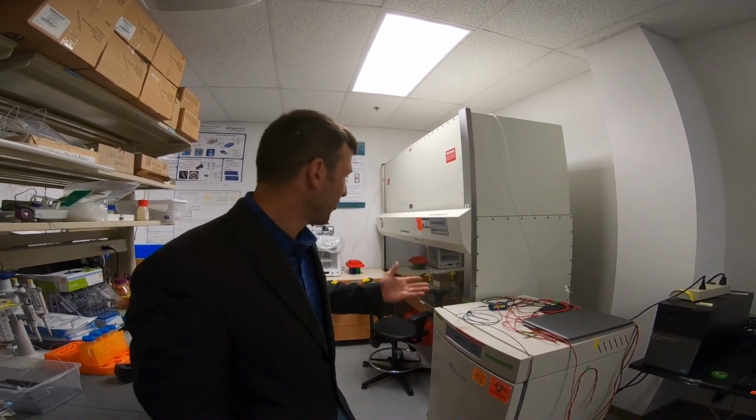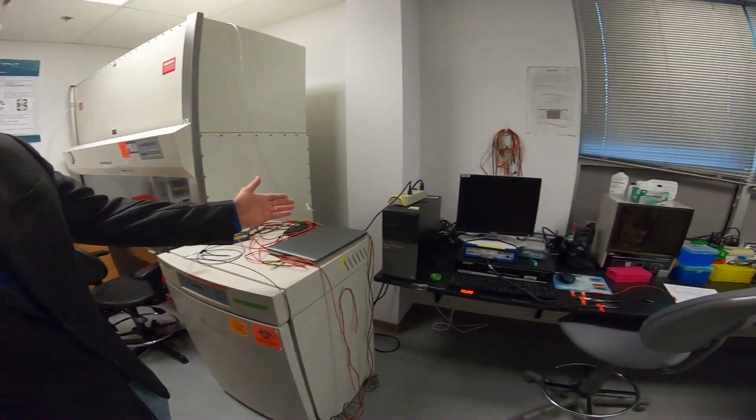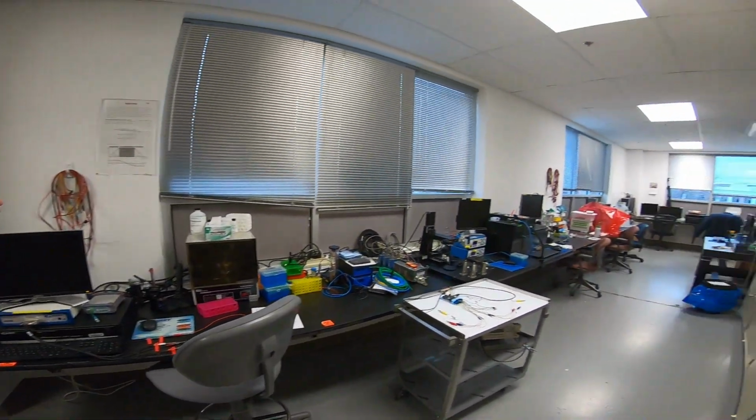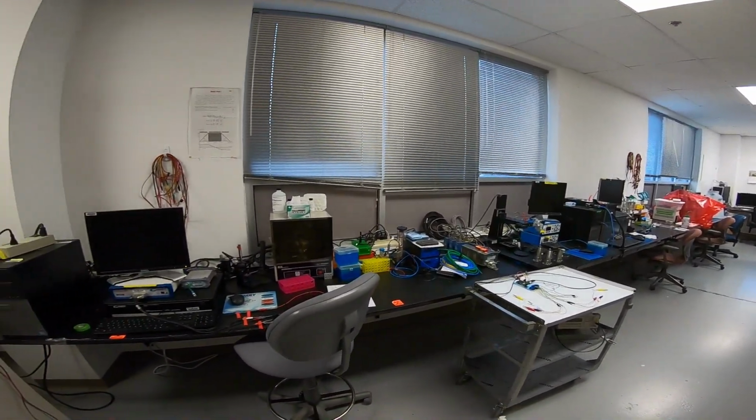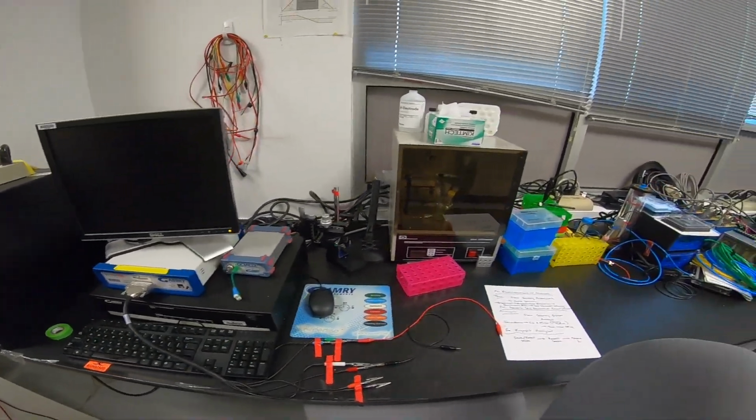So in the biomanufacturing and biosensing lab, we're very lucky to have access to some really top-of-the-line analytical capabilities and resources for both biomanufacturing, for growing microbes and developing processes that are based on microbes, and characterizing those products and those processes. In the corner of the lab, you can see here that we have dedicated biosafety cabinets and incubators for cell culture applications. We also, down along this wall of the lab, have an abundance of analytical techniques and robots that are leveraged for these applications that I discussed in the past.